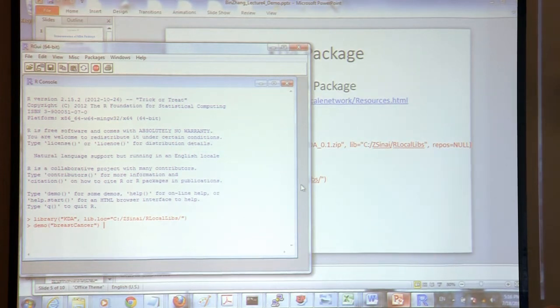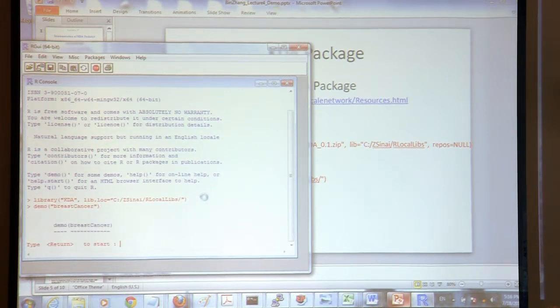example includes 2 modules. This is part of work that is still in review, but I would like to share it with you now. It includes the 2 modules we identified through WGCNA.